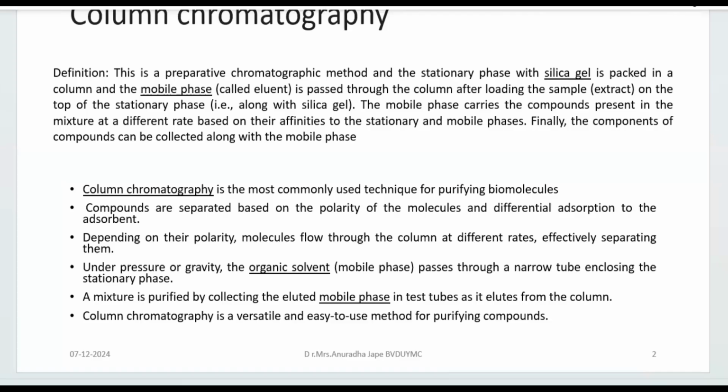Of course, we can apply high pressure to facilitate the movement of these analytes along with the mobile phase which is running down, but that is not the common technique. It is the HPLC technique, high pressure liquid chromatography, where you apply pressure. If it is moderate pressure, it is MPLC. If it is high pressure, it is HPLC, like that it is talked about.